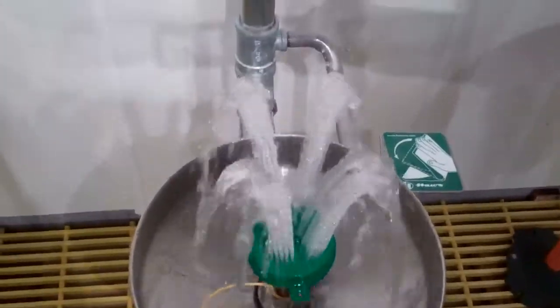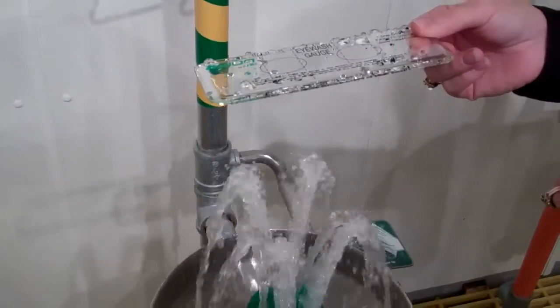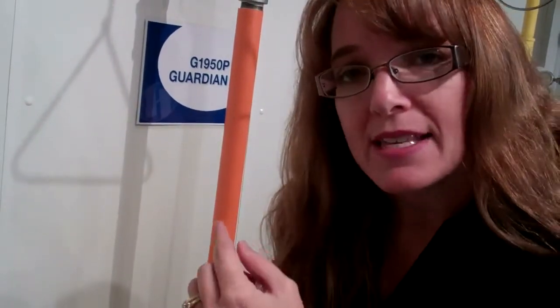If it were way up here, that would not pass because it would be over eight inches. It also gives you the opportunity where you could hurt someone because they have too much pressure going into their eyes.